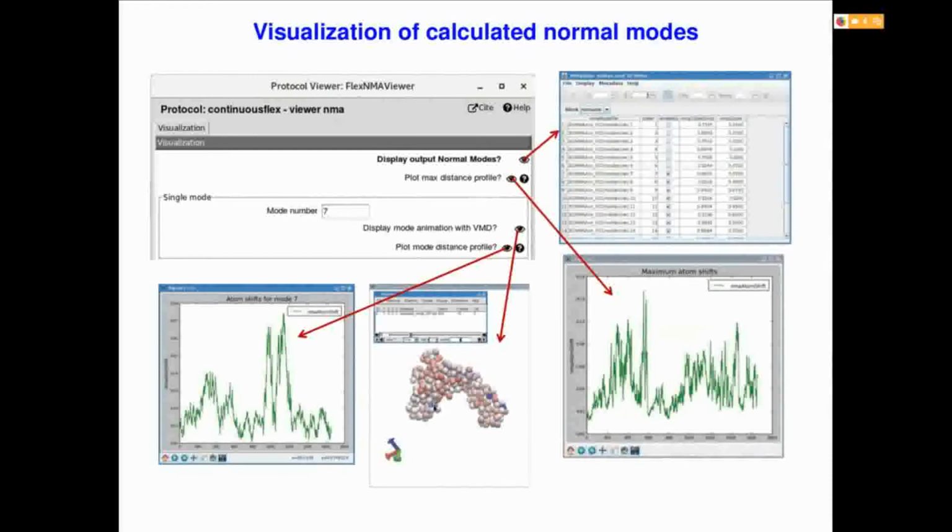In which case, you need to change the interaction cutoff radius, or do something else with the structure, like put mass, if the density map is your reference. You can also experience these isolated movements of some atoms in the VMD animations. But these plots can be useful because you can quickly see that something may be wrong.